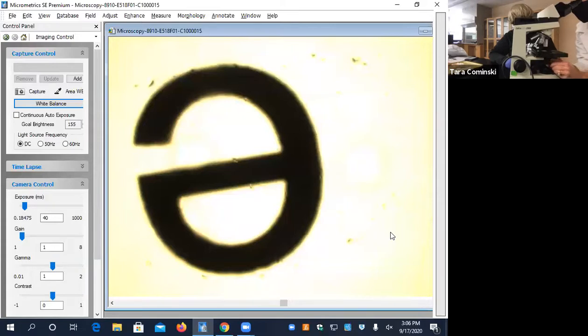So that's probably why you're having trouble. I don't see anything. We have to move. Give you another microscope. Let's see. What the hell? Oh, there it is. What in the heck?